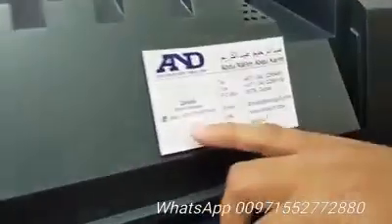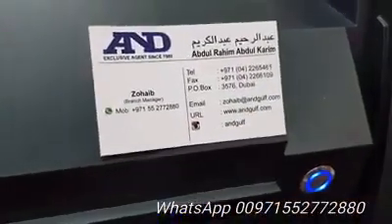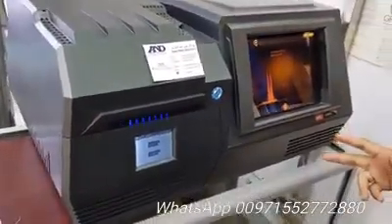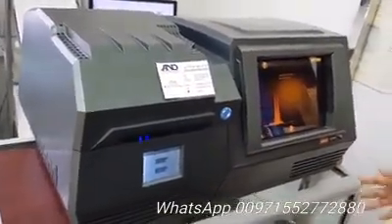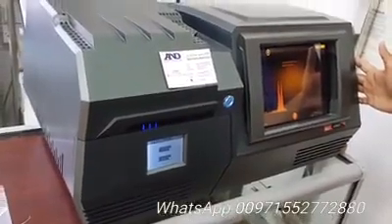Over here we have our WhatsApp number. If you have any questions you can WhatsApp me and ask about prices and details. This is made in China but we are giving a 1-year warranty, and even after 1 year we will give you technical support, so don't worry about it. We have already sold 5 to 6 units.